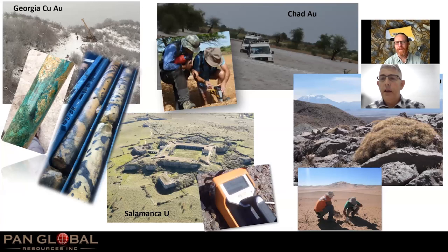And also when I was in Spain working on uranium, what you're seeing there is up near Ciudad Rodrigo. I don't have any information to share with that, but this is up at Ciudad Rodrigo, where Wellington was fighting the French back in the 19th century. And all of that area is covered with uranium shows. And the great thing that we had with the Vanta is we don't have any conversions between eU grade and then trying to get gamma radiation back into eU grade. You can just go straight into chemistry, and we had amazing results with that.